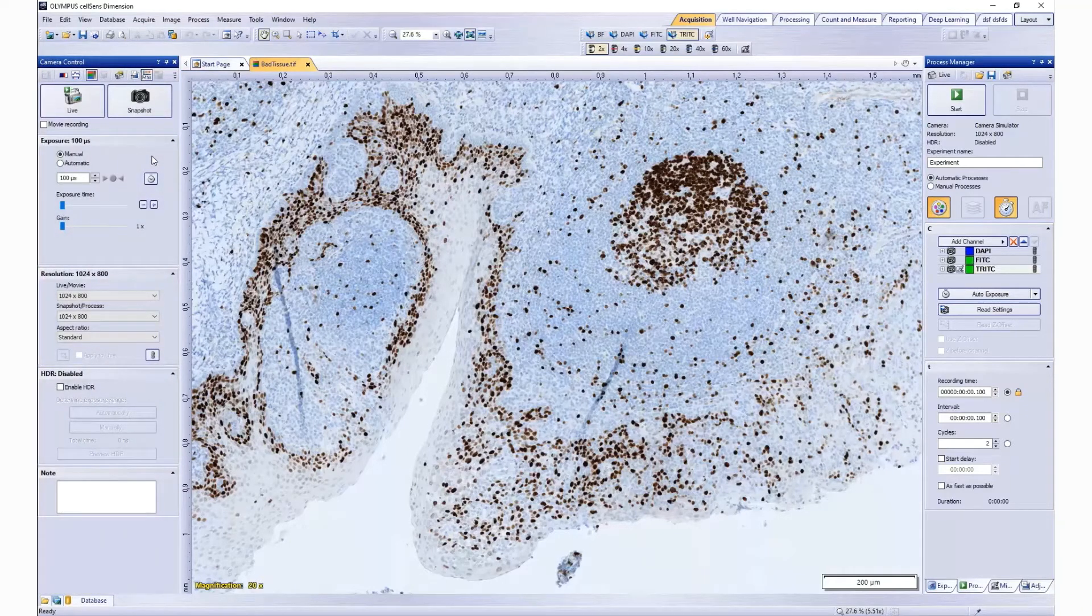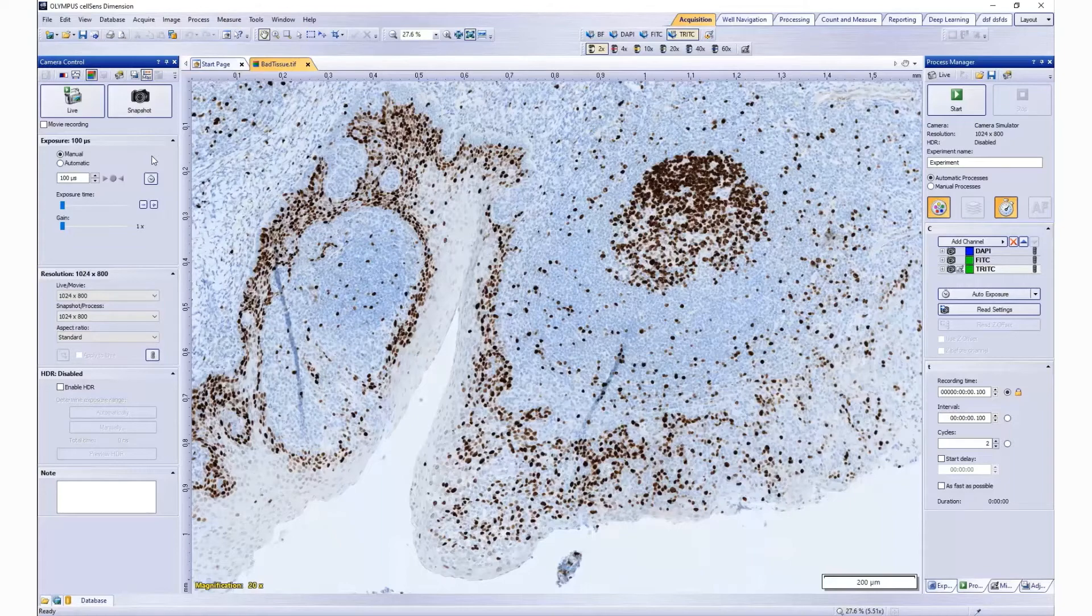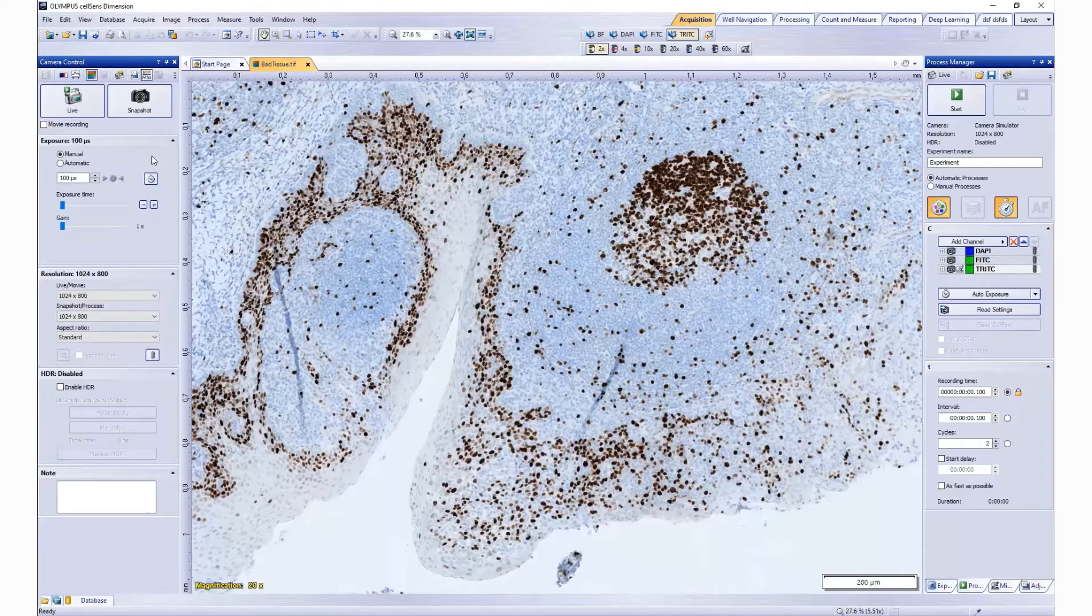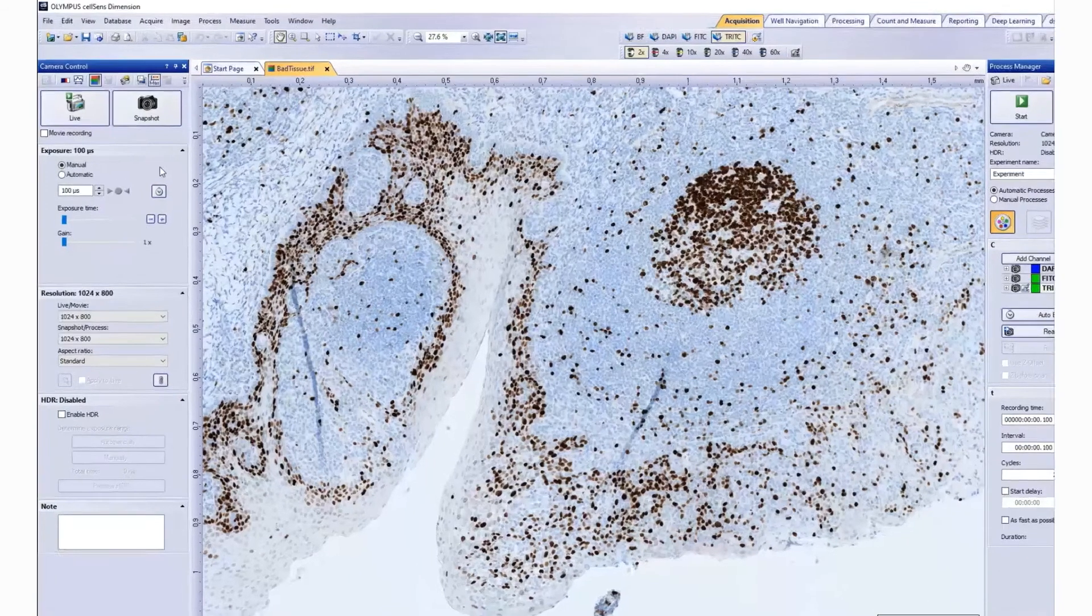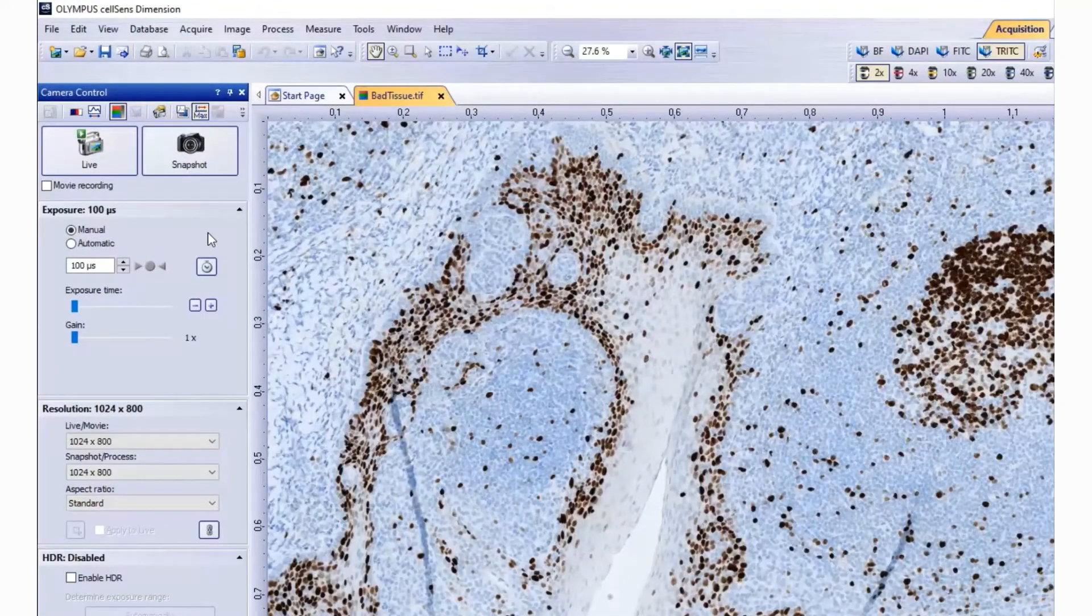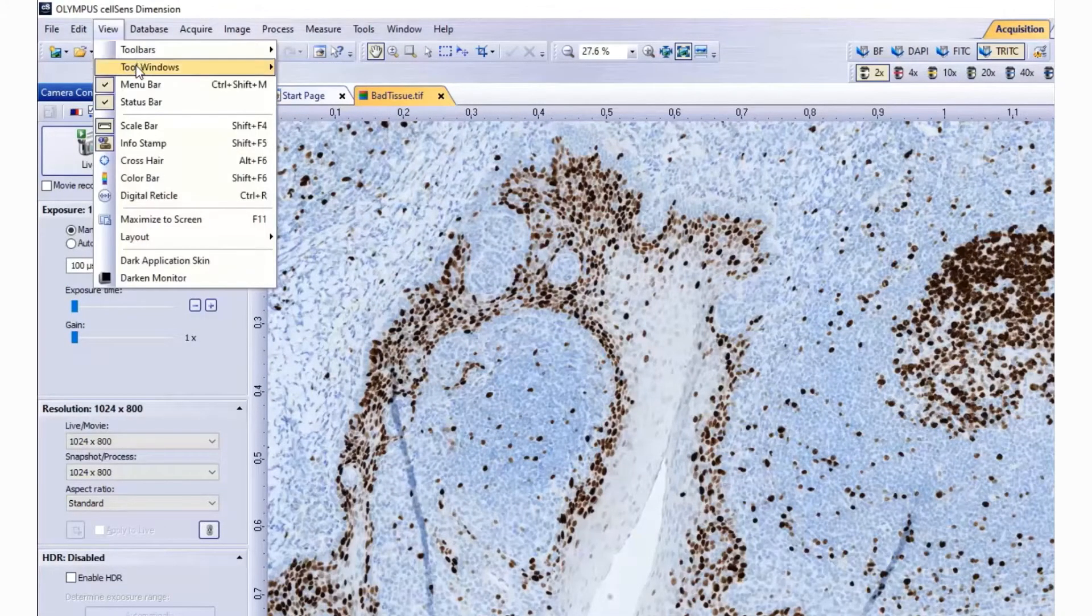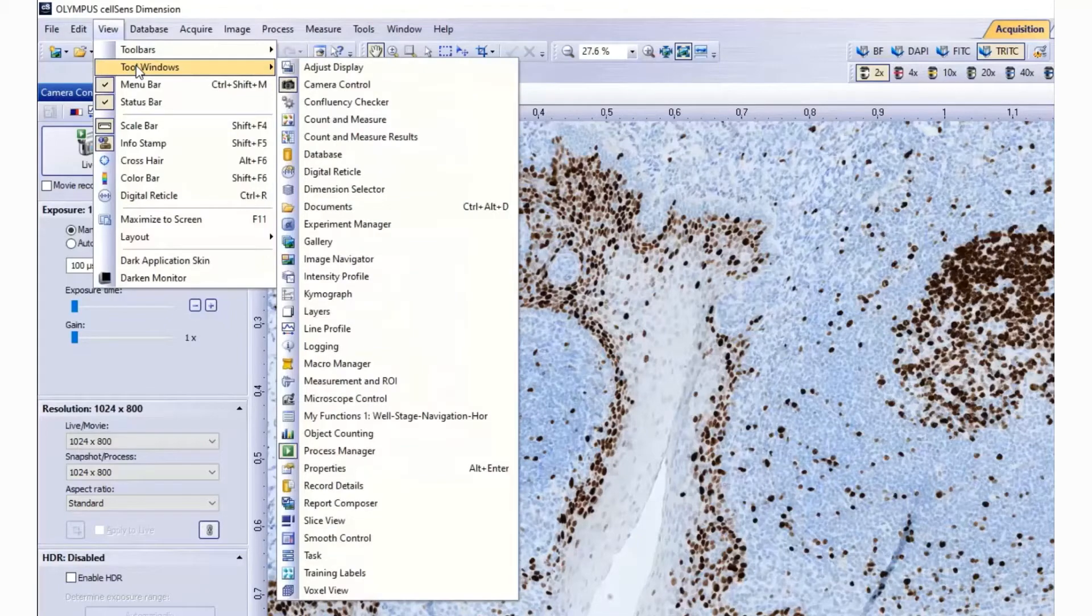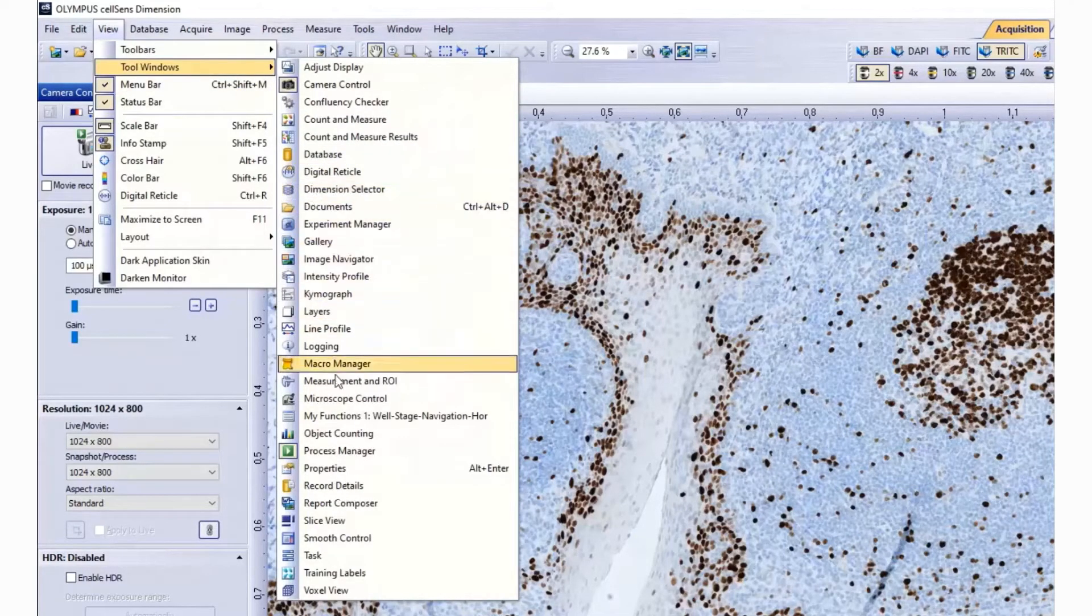Which tool windows are shown by default depends on the layout you have chosen. You can, at any time, make specific tool windows appear or disappear manually. To do so, use the View Tool Windows command and select the tool window you would wish to show or not.